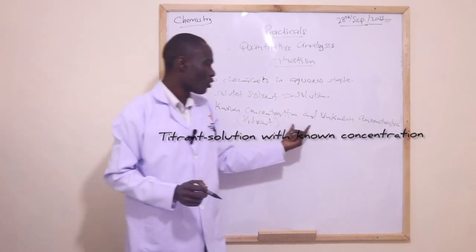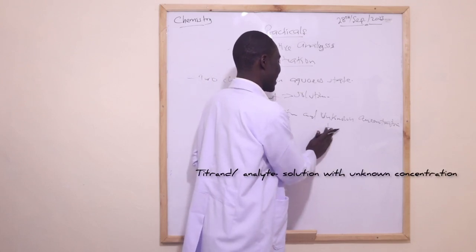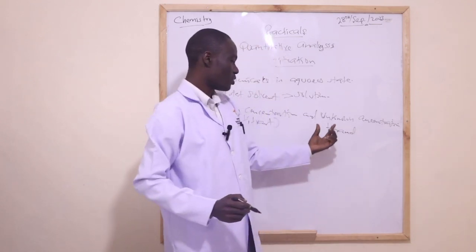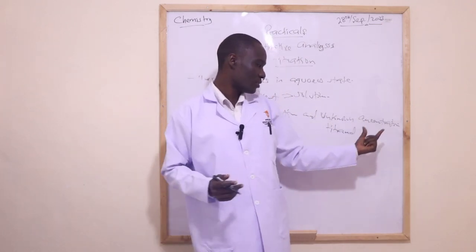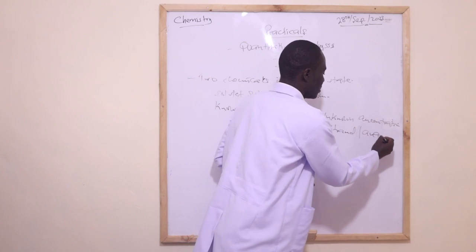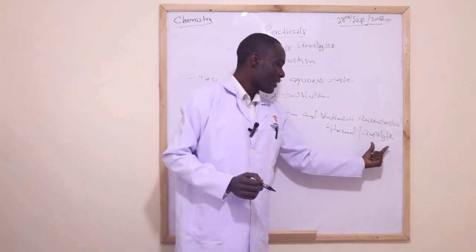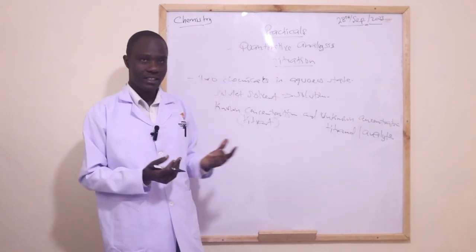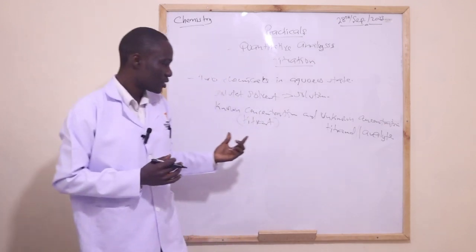So we have titrant and analyte. If you're not used to the term analyte to refer to the unknown concentration, you can call it by another name, but we will be going by the term analyte so that we avoid confusion, since the two terms sound similar when pronounced.